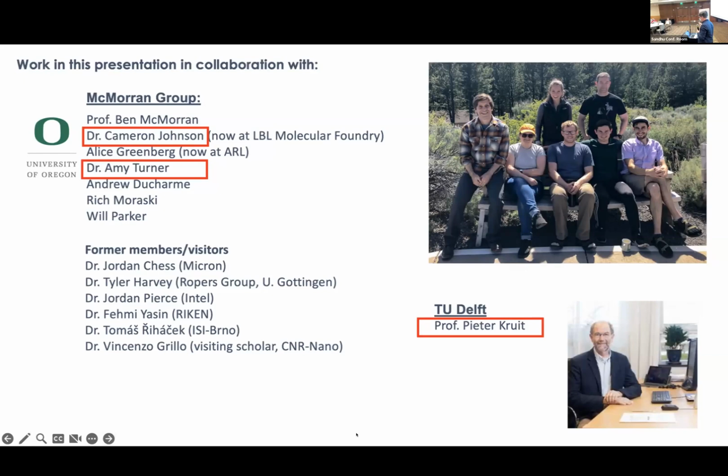You can look at your normal phase contrast. You can even look at the X-rays that come out. So if there's an excitation that didn't necessarily damage the molecule, but you get some kind of photon excitation, you can detect that. You can look at your phase shift. And you can look at this IFM. So the advantage of using the scanning probe technique is it's a multimodal imaging technique.